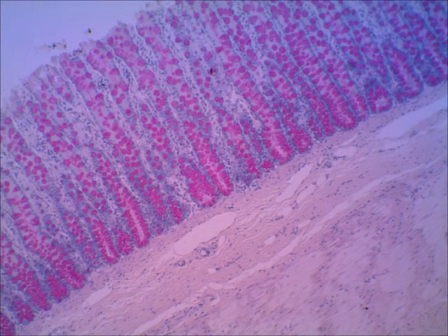Okay, that's it for the digestive system slides. Of course, there are some other digestive organs. There is a pancreas, there is a liver, but I don't have those for you on a test or a quiz. So for digestion, make sure you know the salivary gland, the esophagus, the stomach, the small and the large intestine, that would be great. Make sure you look at the other slides that I've got in your slide folder besides these in the recording. Make sure you can recognize everything that's identified on those slides. Also look in your lab manual in exercise 43. There's a very thorough description of each of the slides.